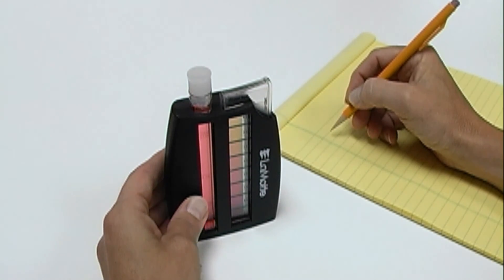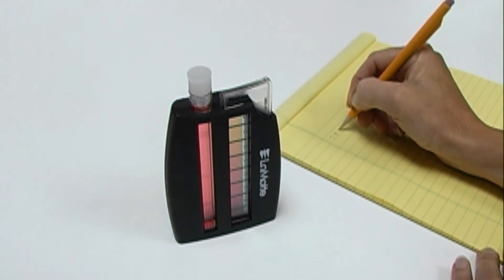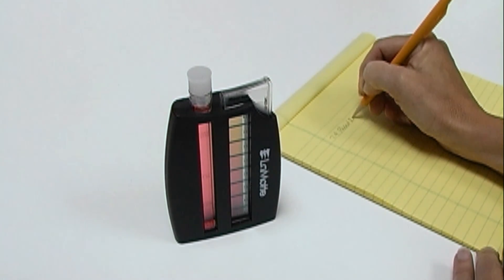If the color of the reaction falls between two standards, take the average. Match the color of the reaction to the standard and record the test result.